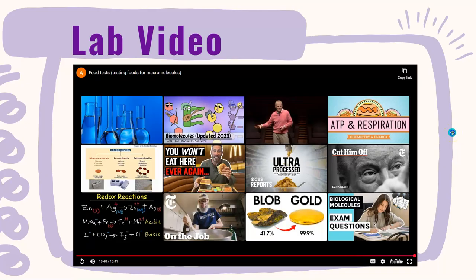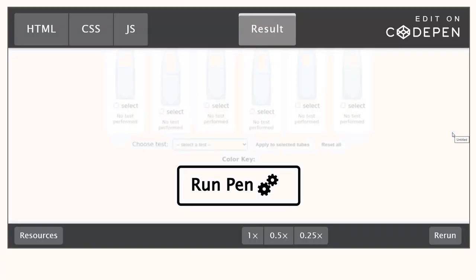The video that you're going to watch just shows you how to carry out 4 food tests using simple reagents. When you use these to identify groups of food in various different foods, you'll be able to do this lab also.